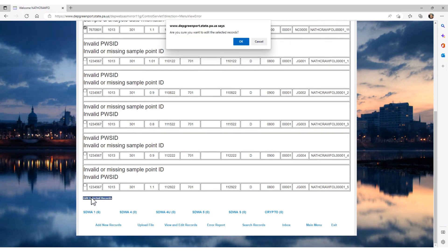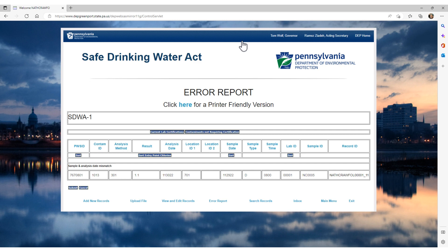A warning box will appear telling you that you are about to edit the selected records. If you want to continue to edit the selected records, click the OK button. If not, click the Cancel button. You are then taken to the page where you can edit the record or records. This page will display what the error or warning is. For our example, the error is that the sample date does not match the analysis date. Looking back at our laboratory results, we see that the sample date was entered incorrectly. We will enter the correct sample date of November 30, 2022. After we have entered the correct information for the record, click on the Submit button.